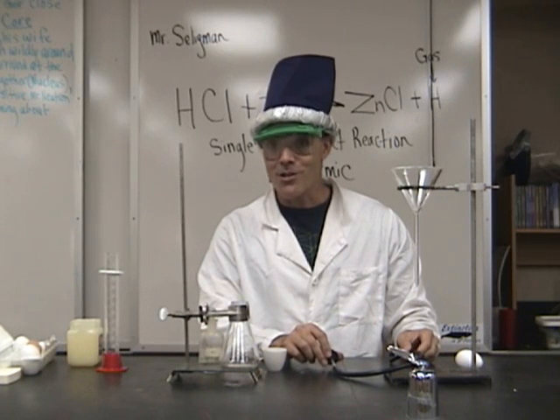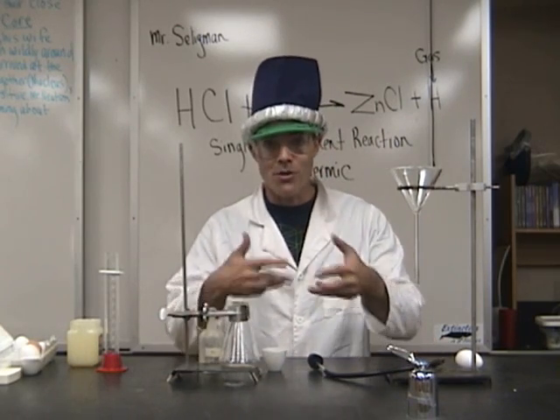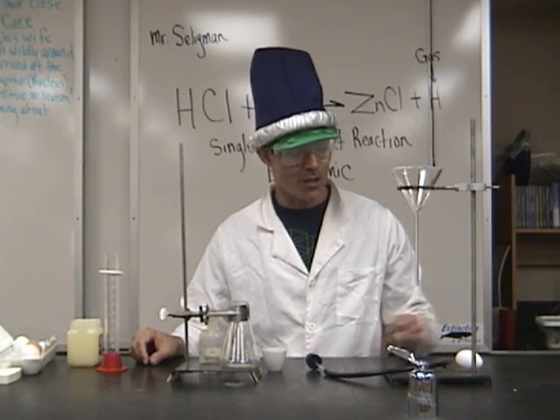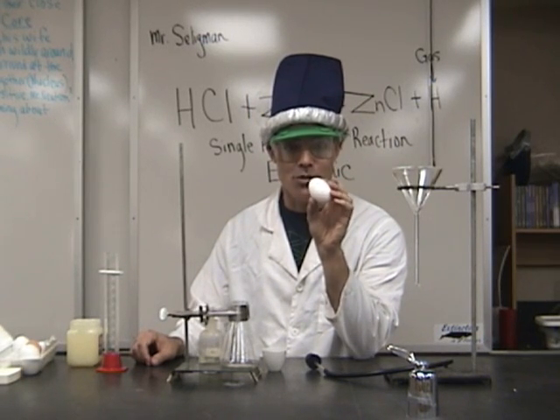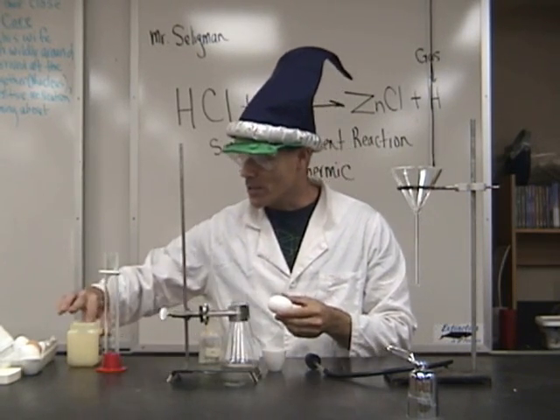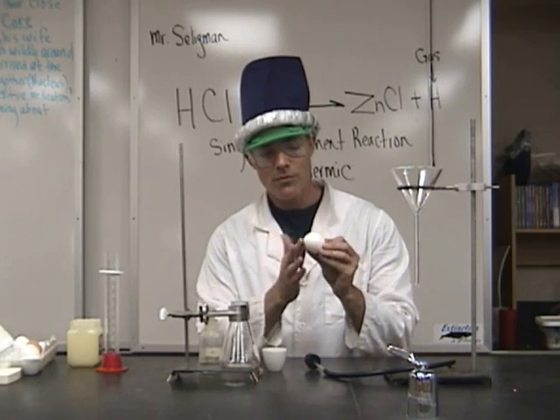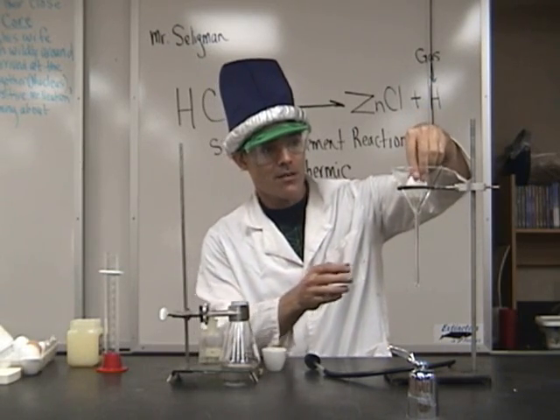I said this reaction is exothermic, so that means it gets warmer — much warmer, considerably warmer. Now, what do you think is going to happen? I have an egg here. I have bored out this egg, emptied out its contents, and allowed it to dry. There are holes in either end, a few millimeters in diameter. I'm going to take some Vaseline and coat the bottom third of the egg with Vaseline like that.